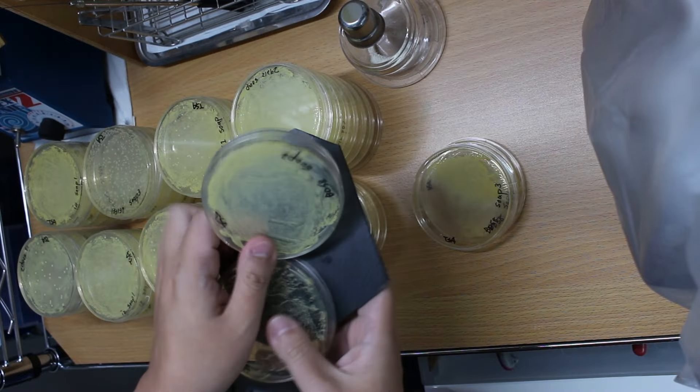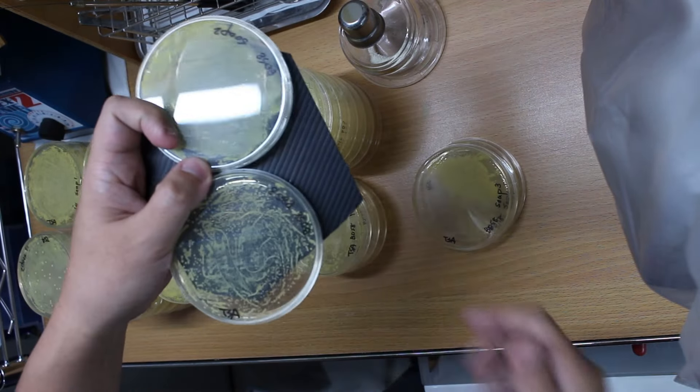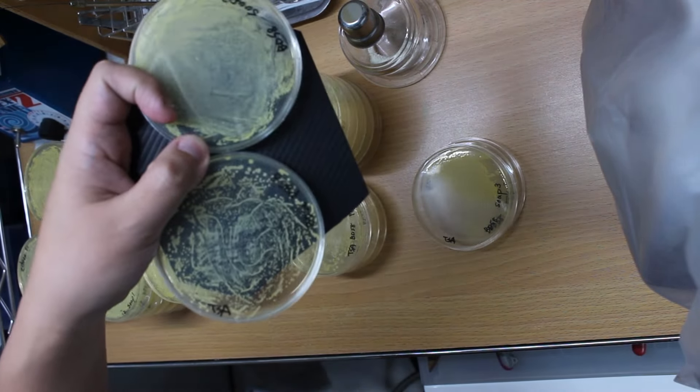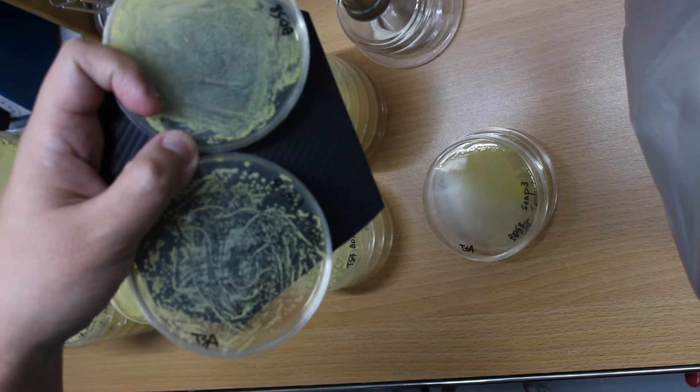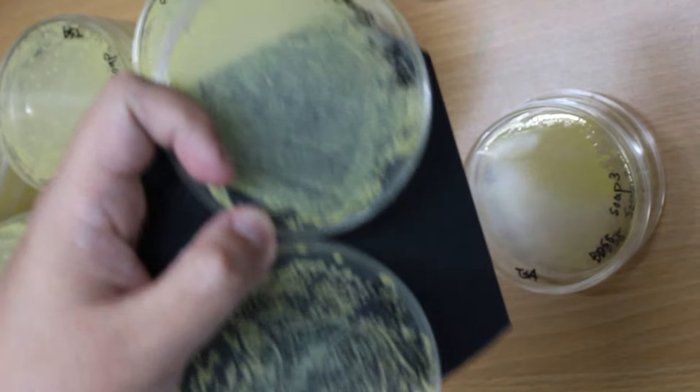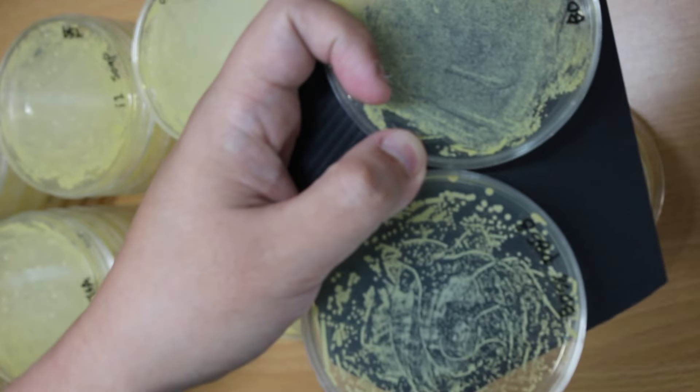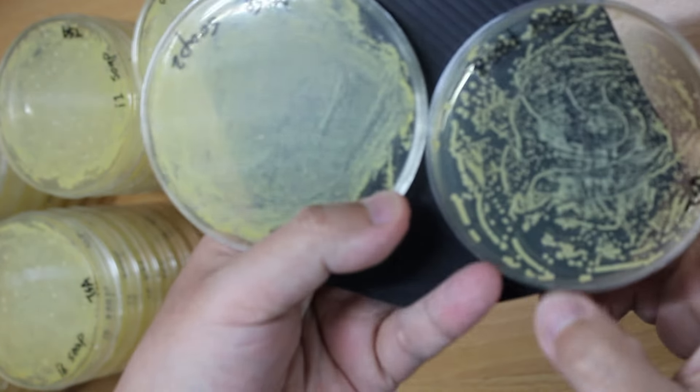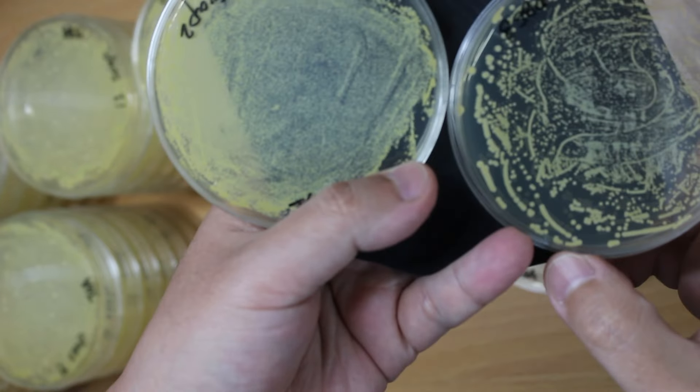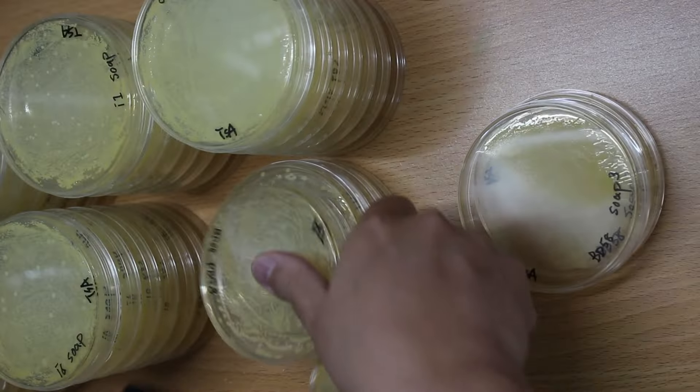So here let's see the result. And since there's too many colonies, I don't bother to count them one by one. But we can see that compared to the group with soap treatment and without the soap treatment, obviously there's not much difference between them.